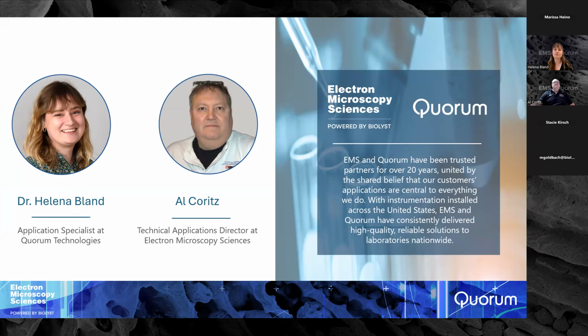Before I start talking about plasma treatment, I just wanted to say a couple of things about what we do in electron microscopy sample preparation. We have four main streams that we work with. One is critical point drying, for the dehydration of high moisture content samples before SEM. We do carbon evaporation and sputter coating systems for the coating of non-conductive samples for SEM. We do cryo preparation systems for the rapid freezing of samples prior to going into SEM. And finally, what we're going to be focusing on today, glow discharge and plasma treatment systems for the cleaning and activation of surfaces of samples.